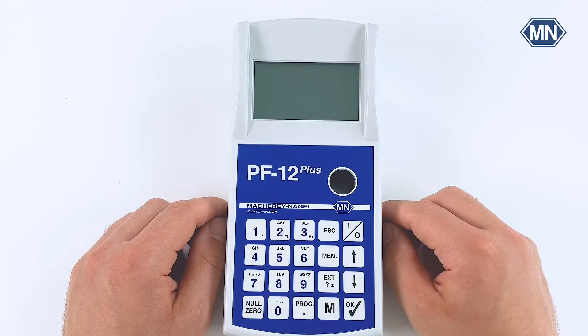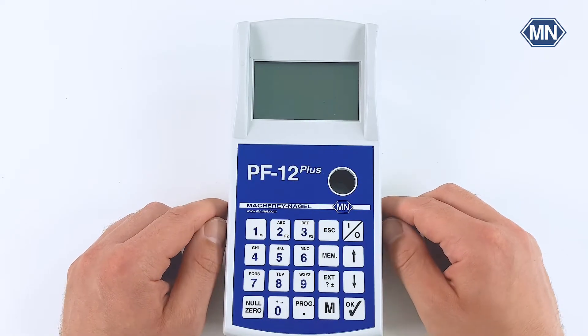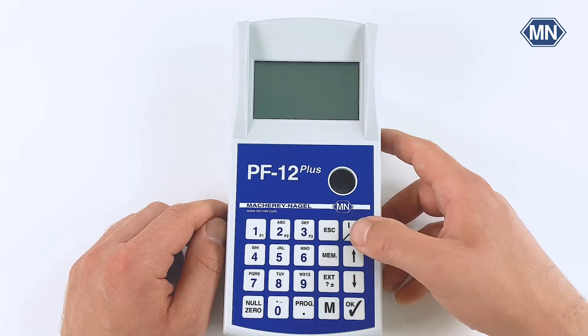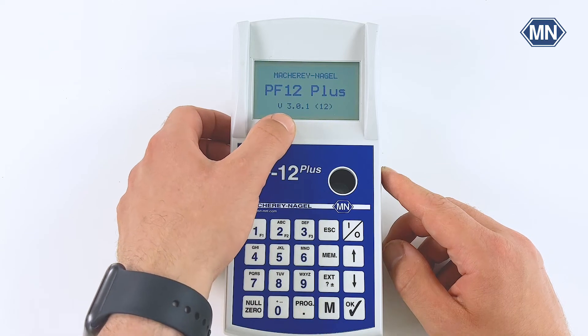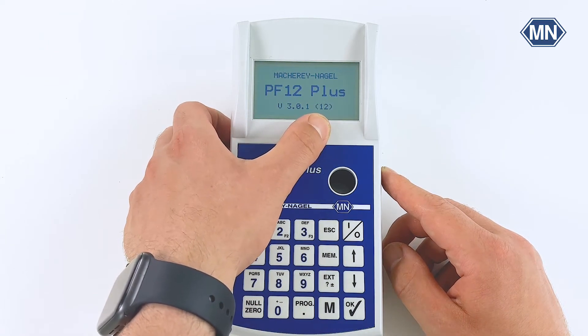The photometer is started by simply pressing the on/off button in the upper right corner of the keypad. During the startup, valuable information like the software version and the parameter version are displayed.